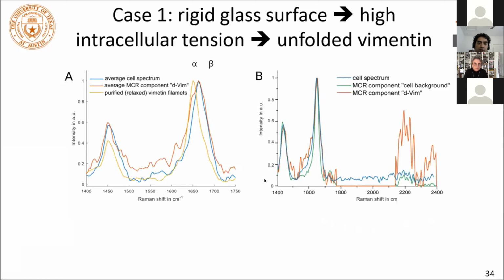But what we showed in our earlier work was that the amide reconstruction was entirely accurate to what you would expect for the protein going in. And so that was in a model system. And so in this case, what you see is the brown, they look sort of like they overlap, but they really don't in the end.